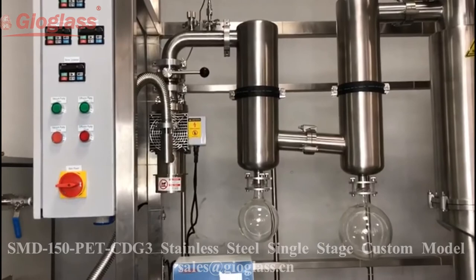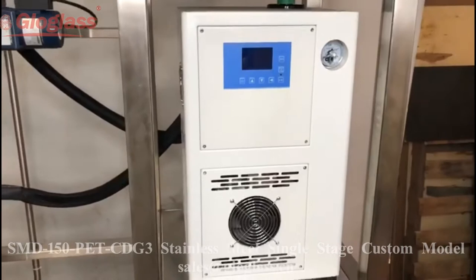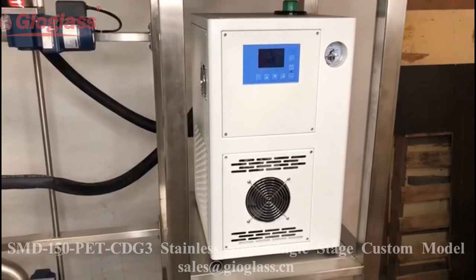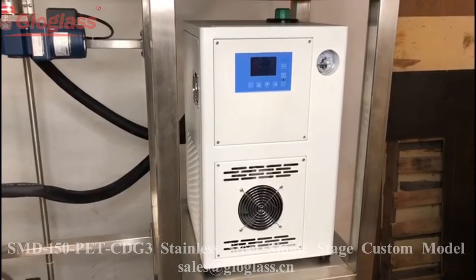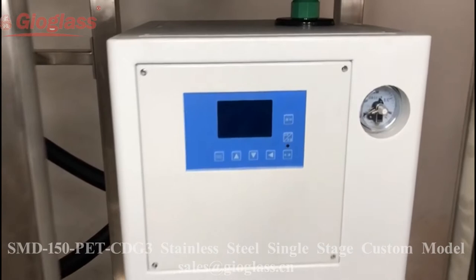C is for the cloth-type high-temperature main heater. This heater has no smell and no smoke when used in our lab, and it can raise the temperature very fast.